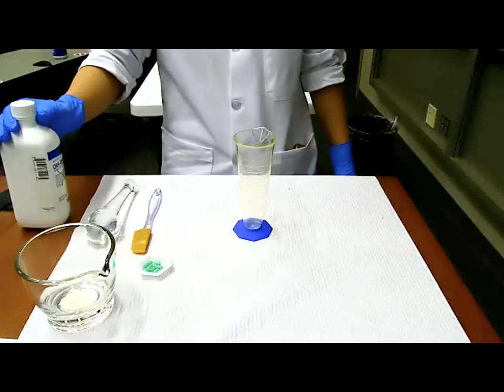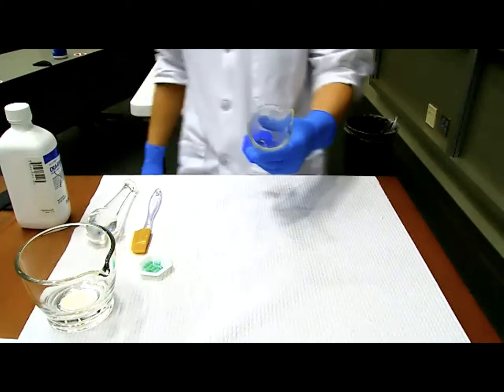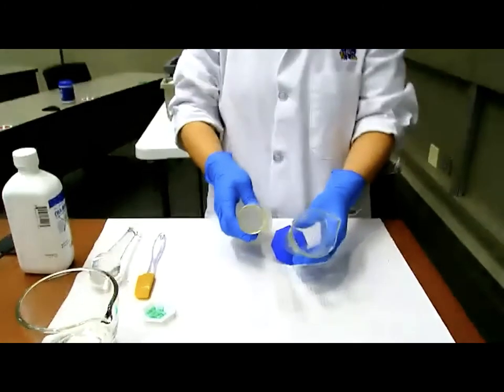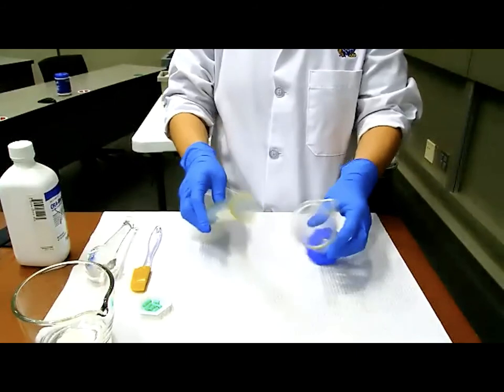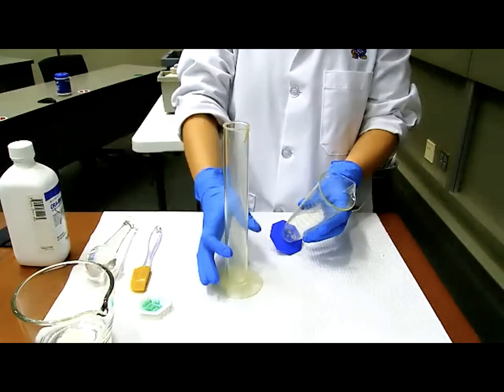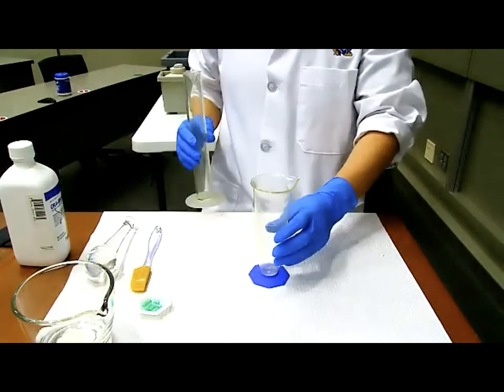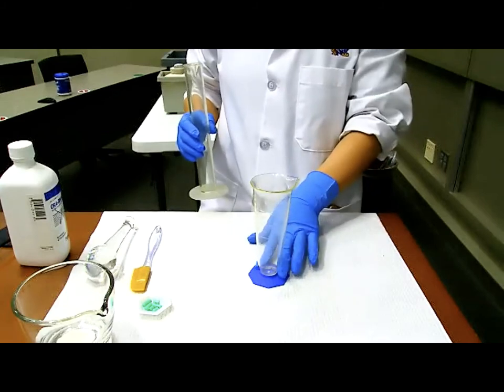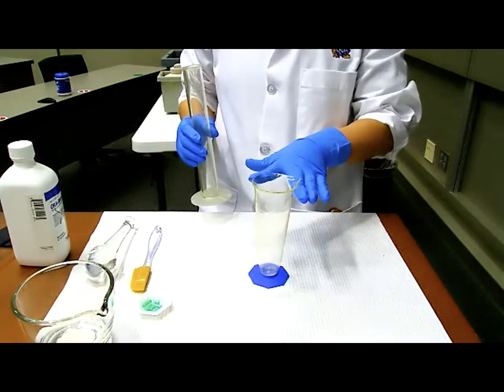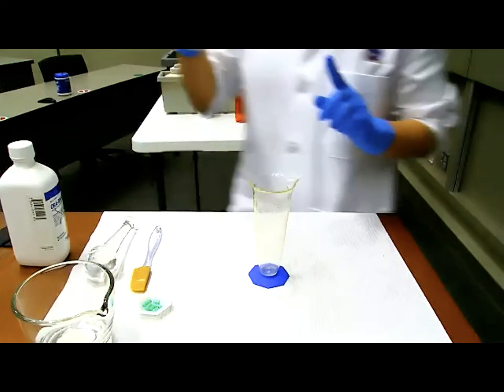All right, so a couple of things. First of all, this is called a graduated conical. And then I'll grab a graduated cylinder for you guys to compare. Hopefully you guys can tell the difference over here. The graduated cylinder is a skinny, uniform diameter container. With the graduated conical, you can see that you start with a skinny, tiny area on the bottom, and then the diameter gets bigger and bigger. So we are using the graduated conical one more time, not the cylinder.